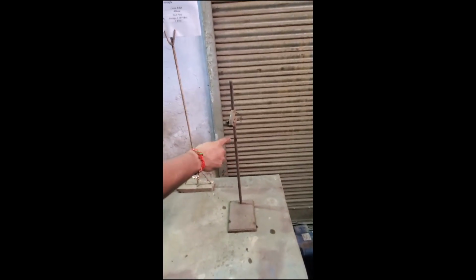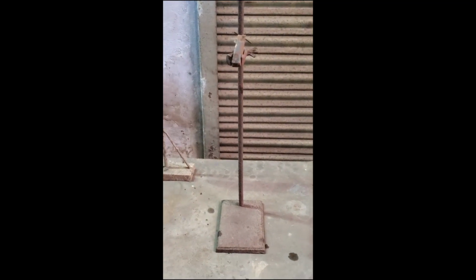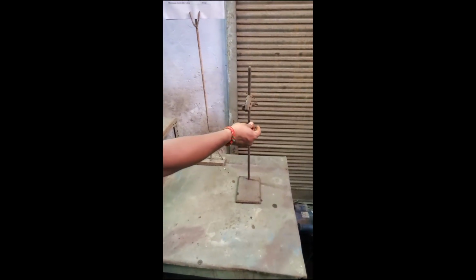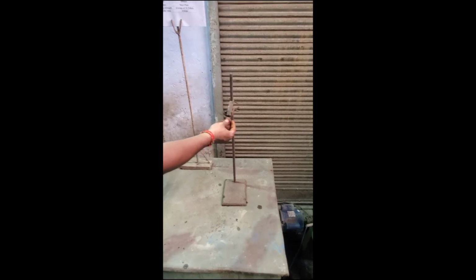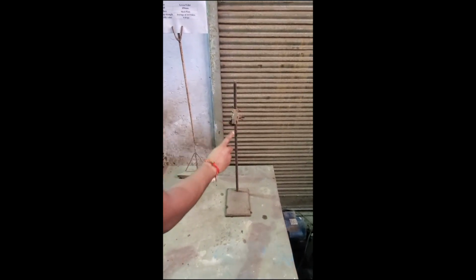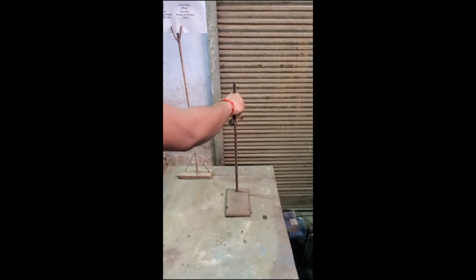It is a small setup. You can see, from here we will drop the pellet. Where? On the metal plate. You can see the steel plate is there. In the steel plate it will drop. Only we have to see how many drops it will sustain without breaking. This is in green condition. Now from 450 mm height we are dropping the pellet.